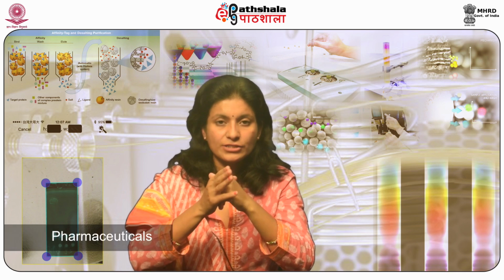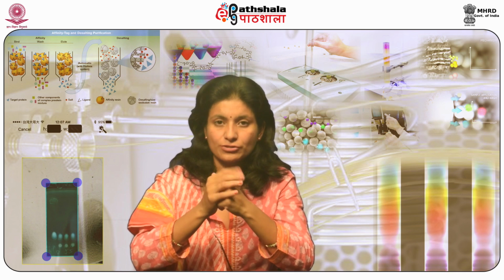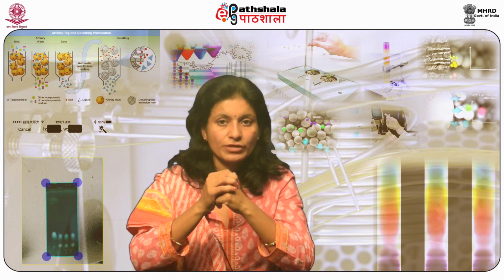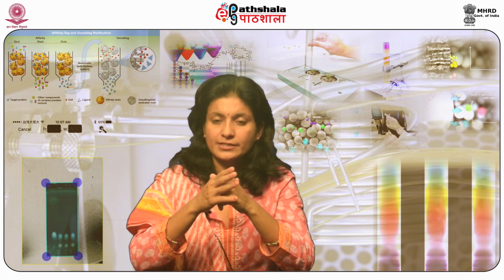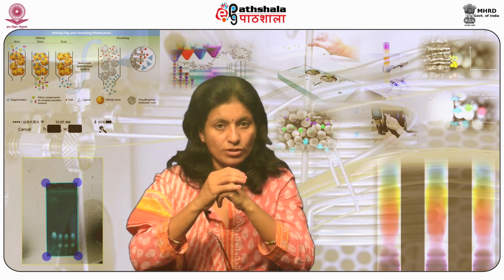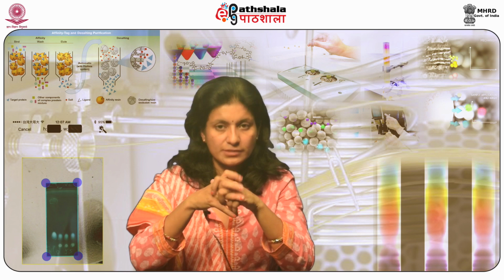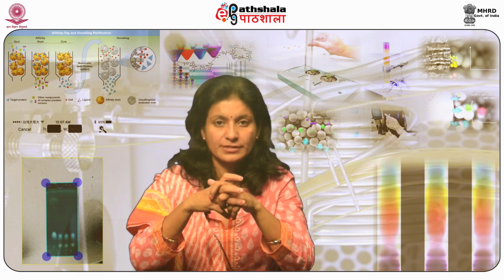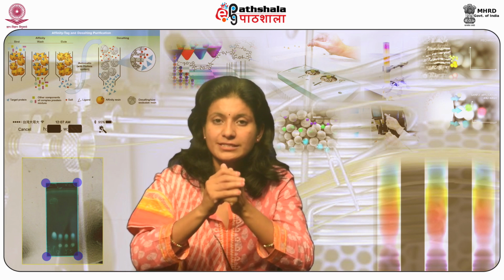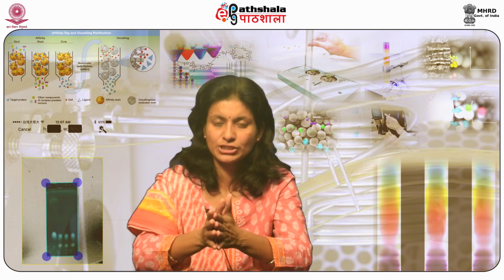Pharmaceuticals. Ion exchange chromatography has an essential role in the pharmaceutical industry for the evaluation of the integrity of medical mixing, determination of selected constituents, and in control production of drugs. IEC is a well-established process that ensures the drug has been manufactured as per sanctioned procedures and also certifies cleaning of the residues from the equipment utilized during the process of manufacturing.